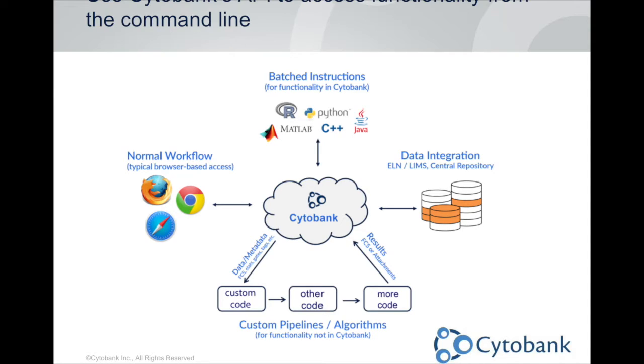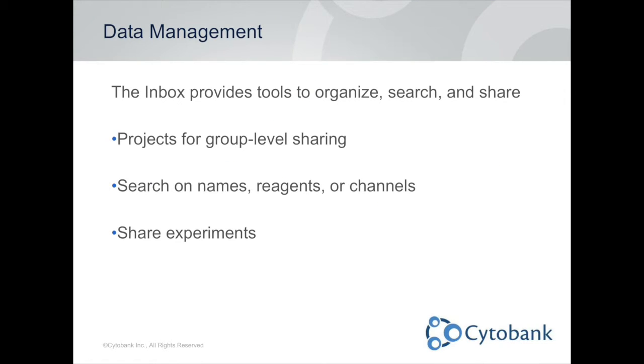So we have a way to interact with your system if you have an institutional-wide backup or data storage system as well. And lastly, Cytobank provides robust data management tools. So hosting all of this data is great, but it doesn't do much for you if you can't find it. So the inbox in Cytobank provides great tools to organize, search, and share your data.